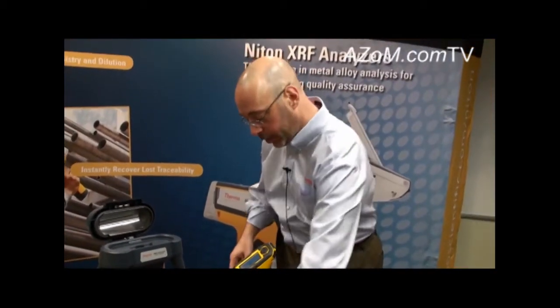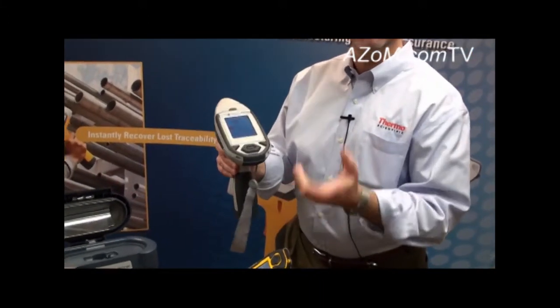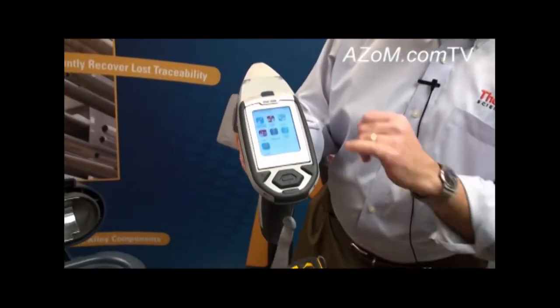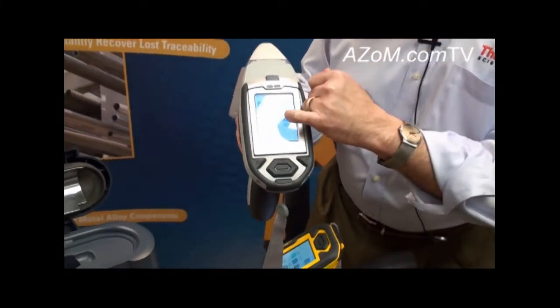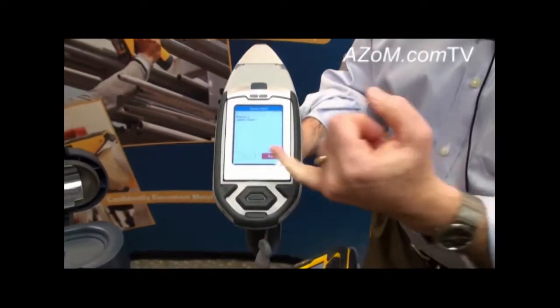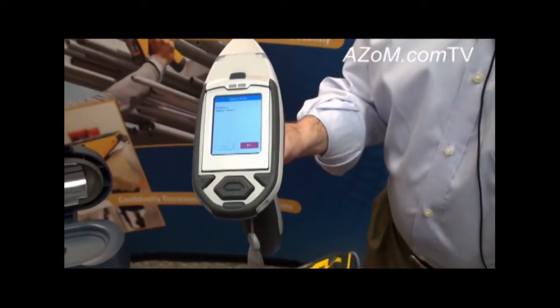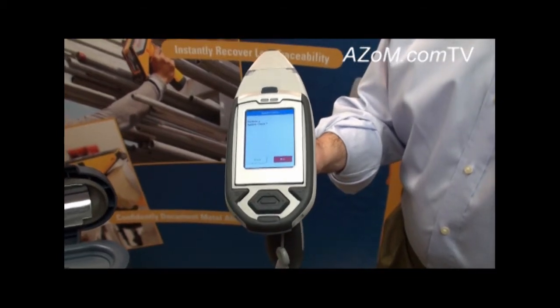The instruments come factory calibrated. When users power them on, we recommend they go through the system check procedure. That's as simple as selecting the system check icon once you log on to the analyzer. That takes about two minutes, and the instrument automatically runs through a self-standardization to ensure that it's functioning properly.